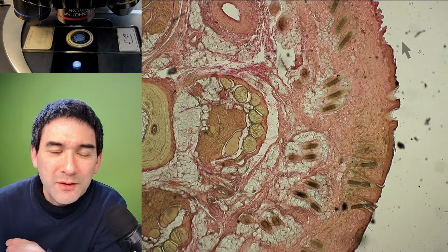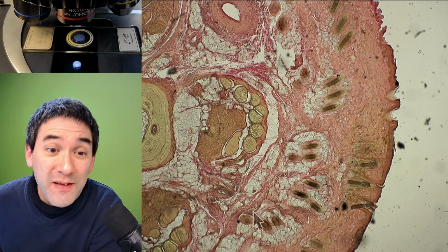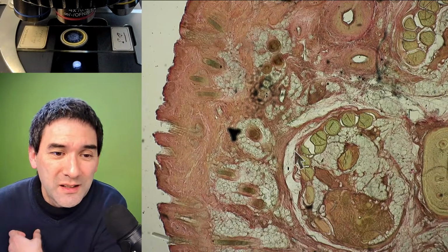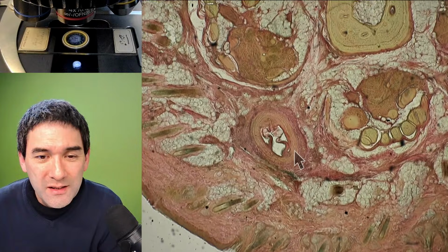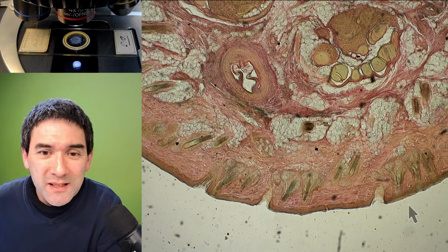Those things that you see over here on the side, that's all fur. So it's basically the hair follicles for the fur. Those white round things are adipose tissue, which means fat storage. Of course, it has to be insulated. Lots of fat in here as well because it protects against cold. So I kind of like this a lot as a histological slide, and honestly, it has survived the test of time. It's still of excellent quality.